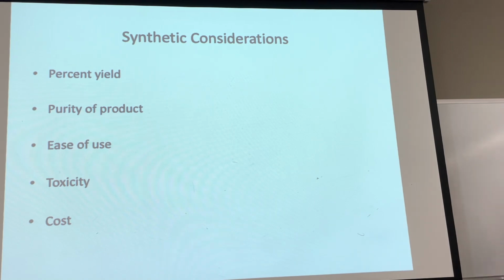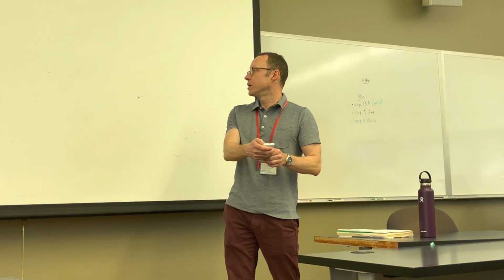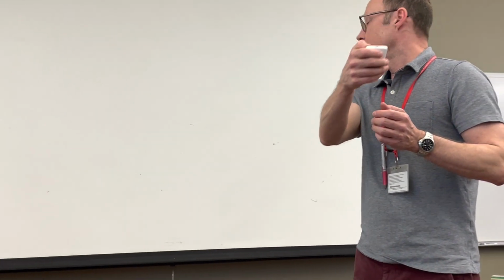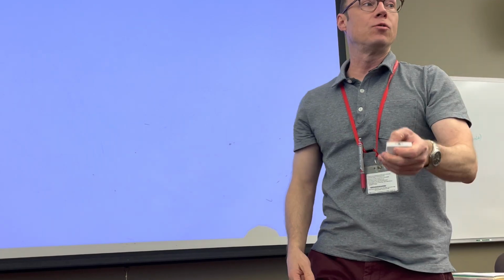Oh, the last thing I wanted to tell you is, because we're doing 3 different procedures with lots of reagents today, there are a lot of reagents out, which means a whole bunch of bottles in the fume hood. So please, please, please, before you just pick up a reagent bottle and start dumping it into your round bottom flask, make sure you read the label twice.